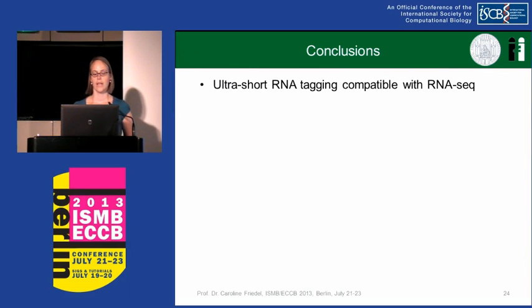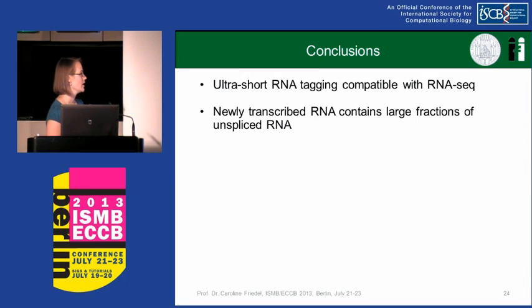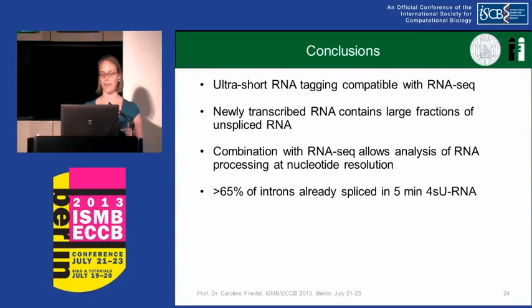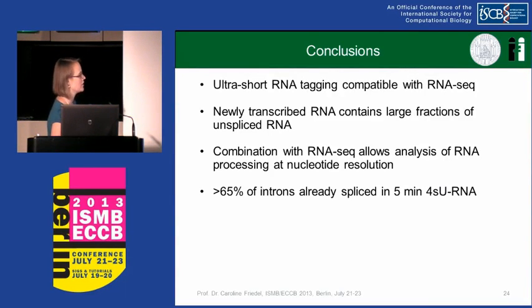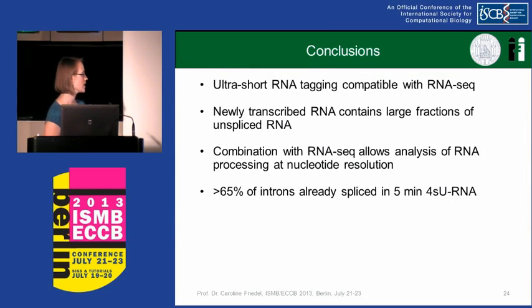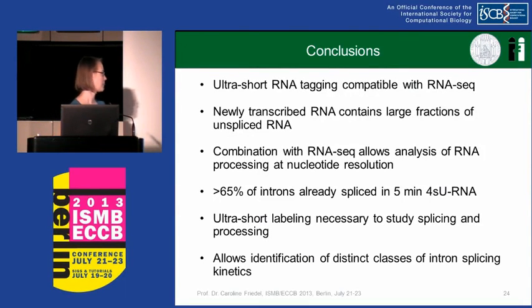Just a few conclusions. What I showed you is that ultra-short RNA tagging is compatible with RNA-seq. The newly transcribed RNA still contains large fractions of unspliced RNA, so the combination with RNA-seq allows the analysis of RNA processing at the nucleotide level. But we also saw that in 5-minute 4sU RNA, at least 65% of introns are already spliced, so we really need to look at these very short RNA tagging durations to analyze RNA processing. And it also allows the identification of distinct classes of intron splicing kinetics, and even the identification of potential novel intron retention events, which have short-term stability but are eventually decayed.